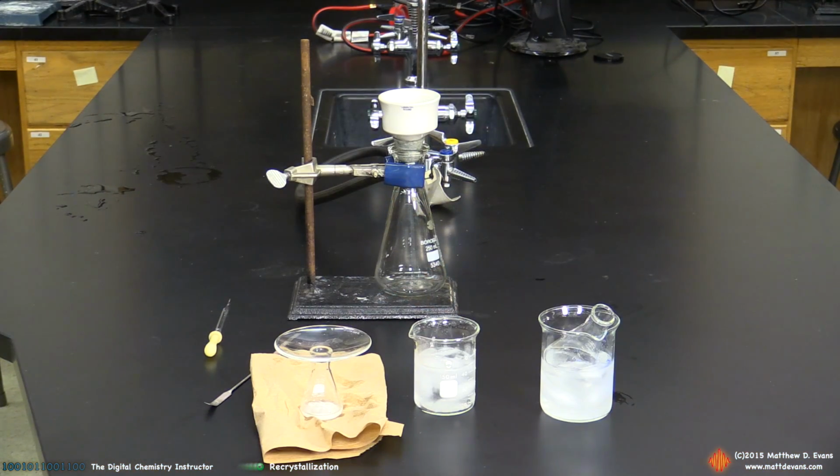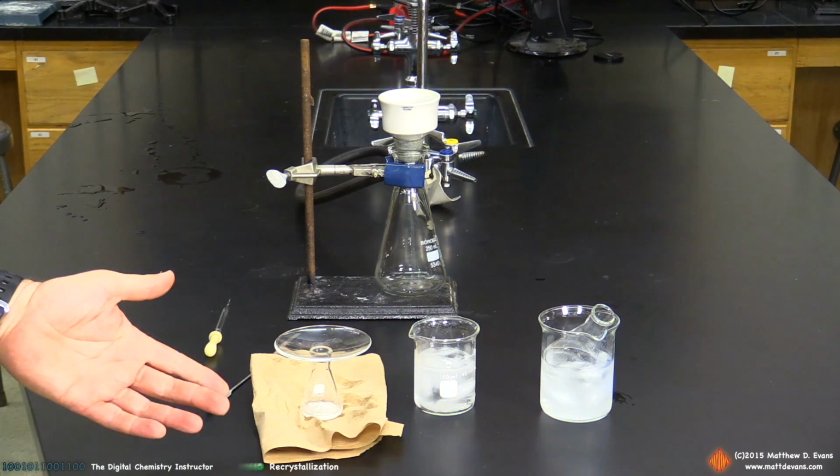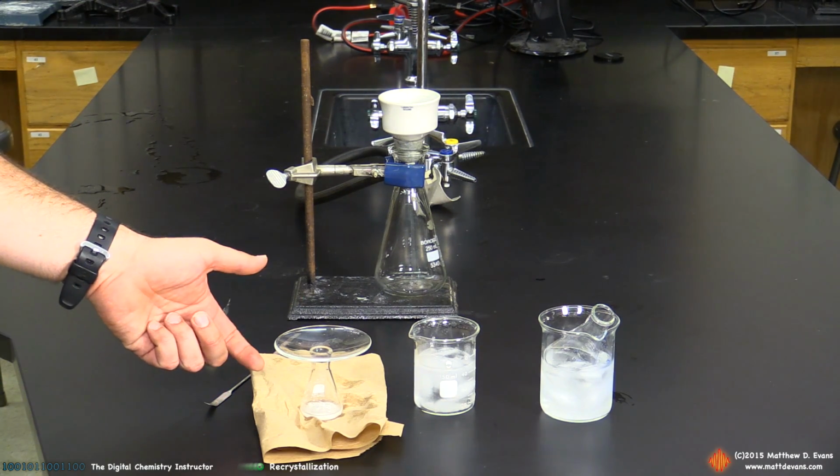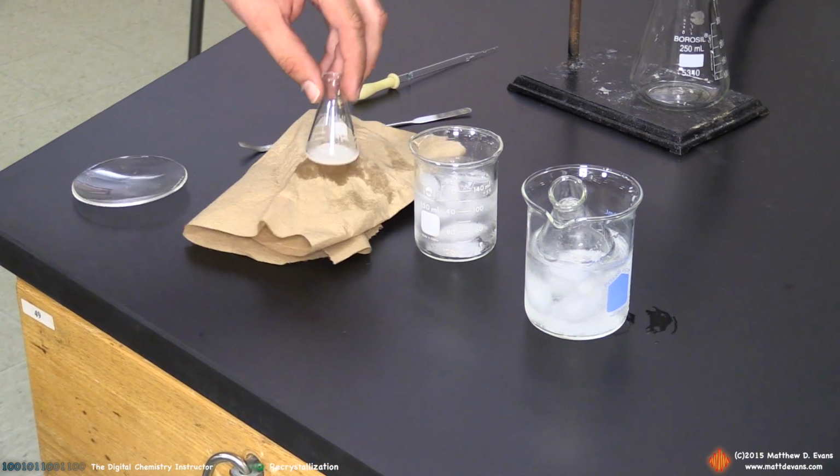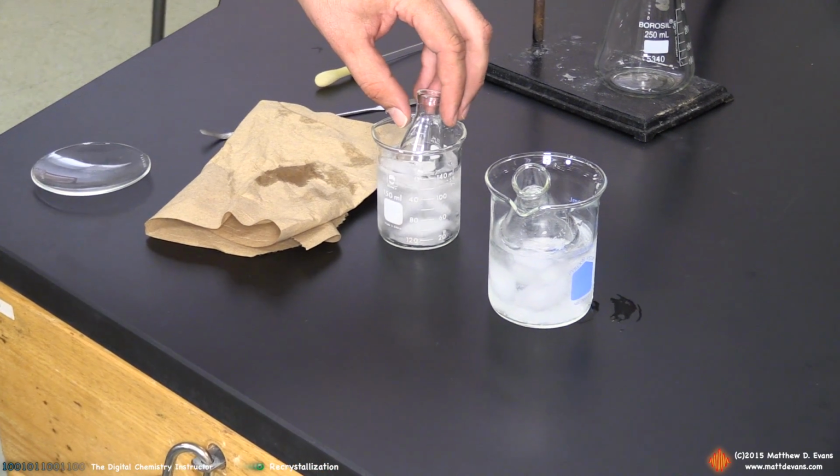We've taken our crystals off the hot plate about 10 minutes ago. We're letting them cool down as slowly as possible. That's why I have it on a paper towel here. I've still got my watch glass. Now, once this flask is cool to the touch, I'm going to take the watch glass off and just put it in a small beaker full of ice and water.